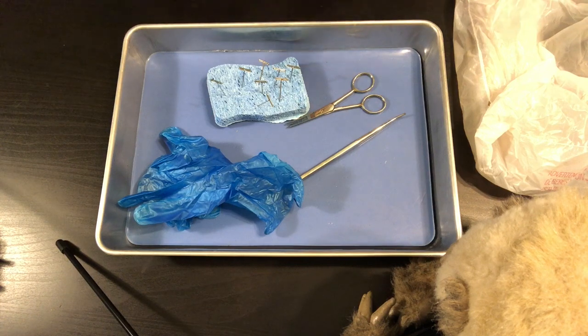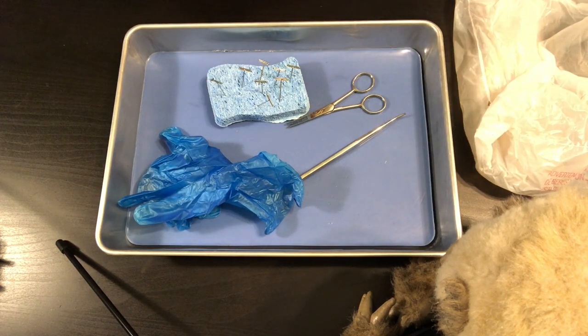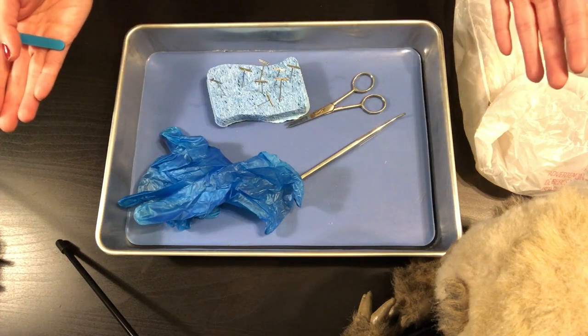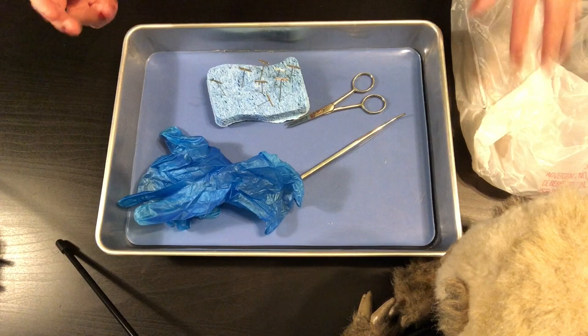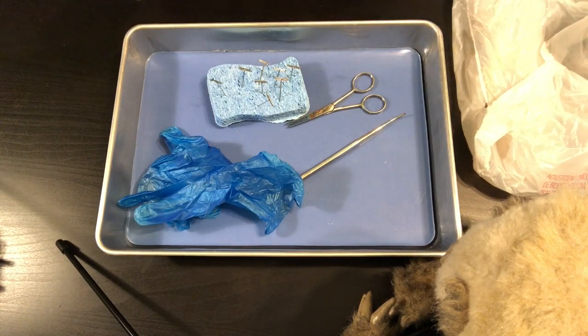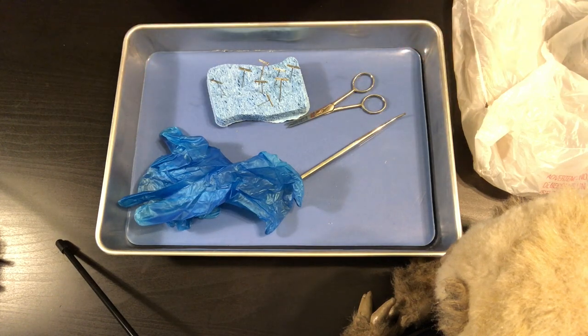Hey guys, this is Miss Martinez, your science teacher. I'm here showing you what you are going to be using for the dissection. I've got a frog right here that I'm going to bust out in a few minutes and dissect, showing you basically all the steps that you will be doing within the coming days.